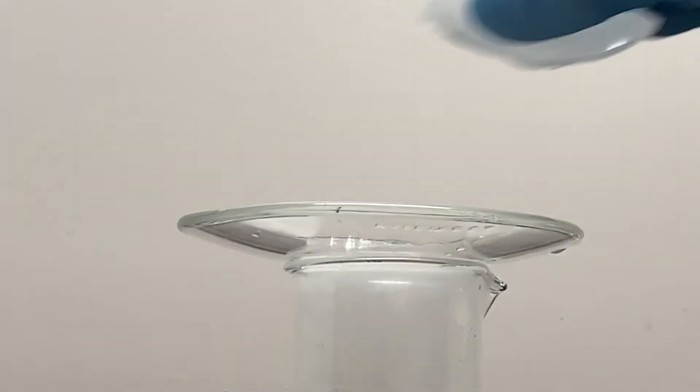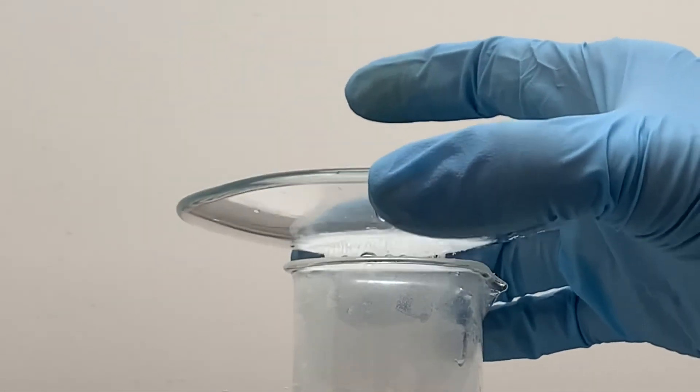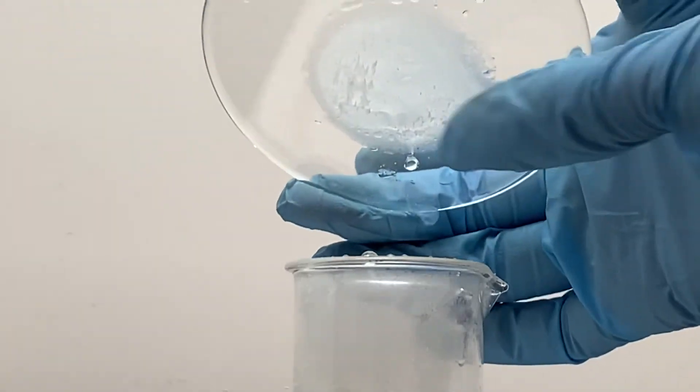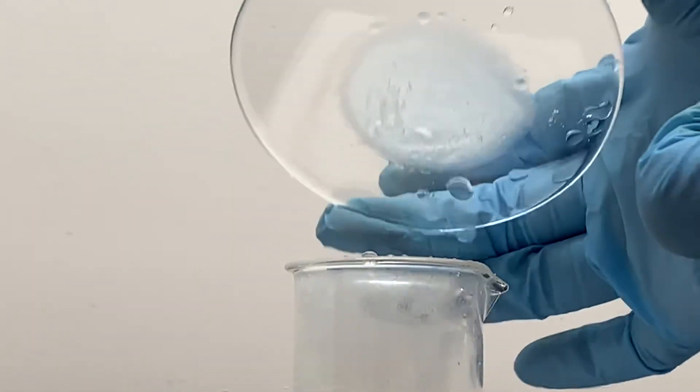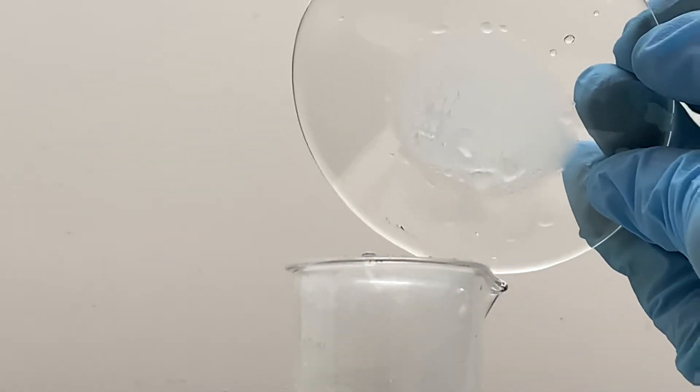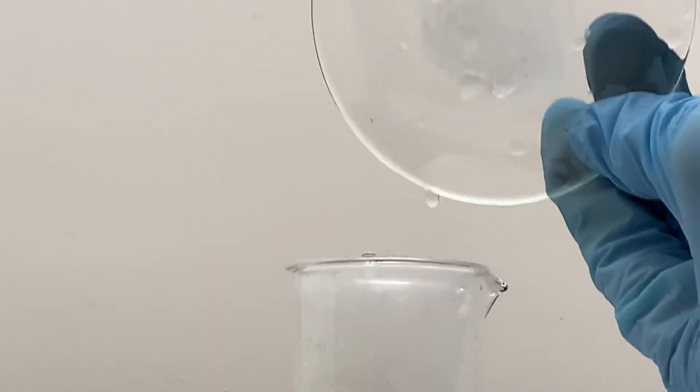So this has been subliming for a while. Let's take a look at what we've got. We don't get a lot of product from this. We can see that we do have some crystals that are formed along the bottom. And what I'm going to do is very carefully transfer these crystals to a pre-weighed watch glass so we can get a mass on them, and then we're going to get their melting point.